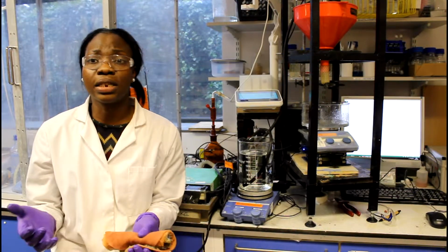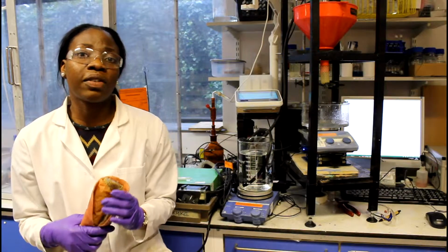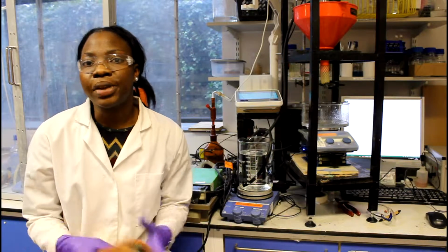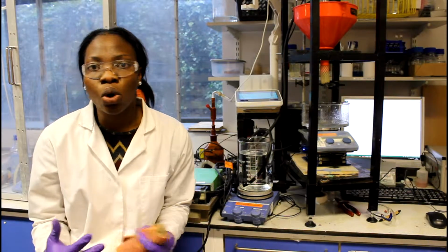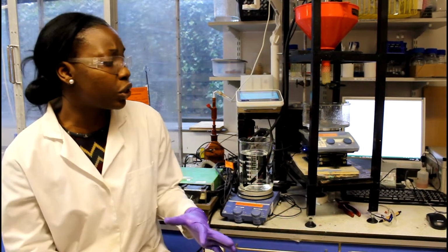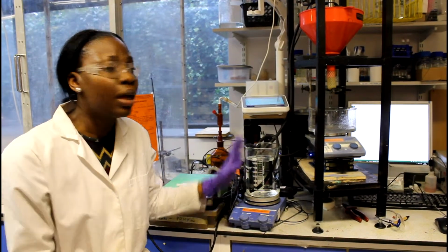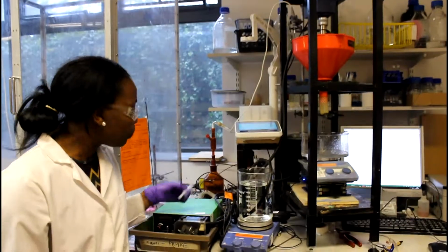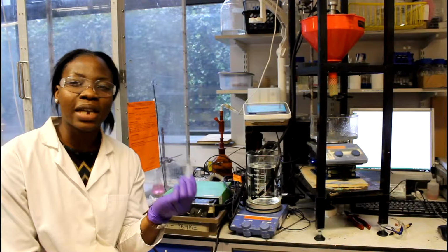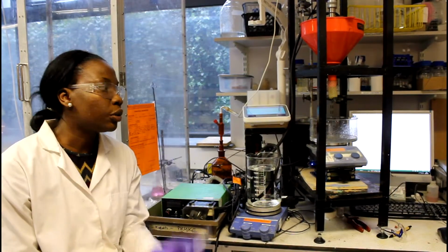The aim of this residence time distribution experiment is to characterize the reactor in terms of how it behaves. So does it behave as a plug flow reactor, or does it deviate from plug flow behavior? To do this, I'm going to need a test fluid of deionized water, and I'm going to need my tracer fluid. In this case, this is a non-reactive tracer, and it's potassium chloride solution. It's 0.5 molar in concentration.